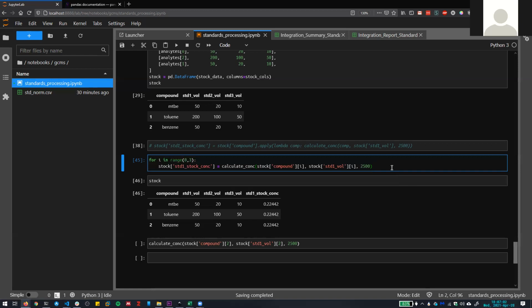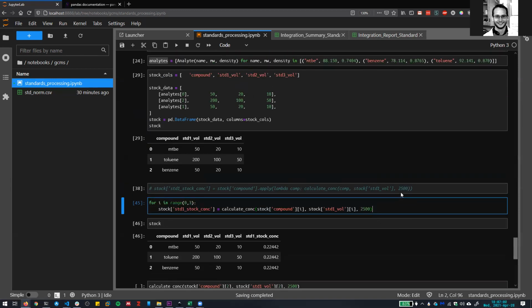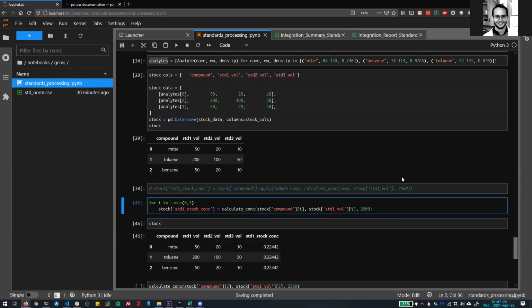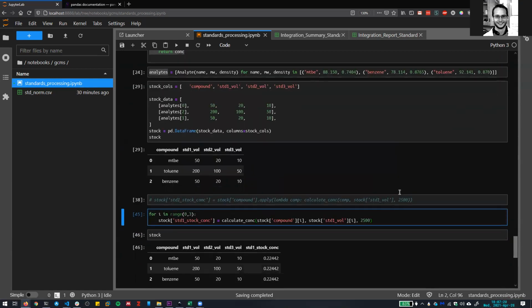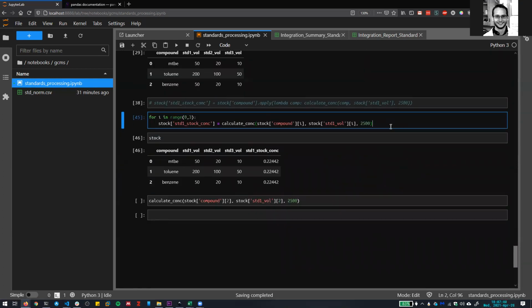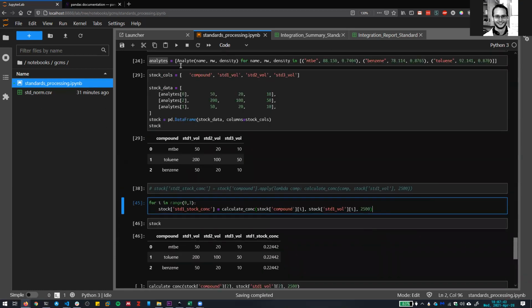Yeah. Okay. So for the people that are here, has this been useful, or is this just way over the top Python stuff? It definitely makes way more sense than Mathematica, and that's how I first started. Okay. Cool. I really wanted to do this Python stuff because I think it's a very useful and cool way to do things, and especially if you learn how to do this well, then your careers in grad school or whatever job you get are going to be so much easier. So why don't we stop here for now, and I will spend some more time figuring this thing out. I'm almost there.